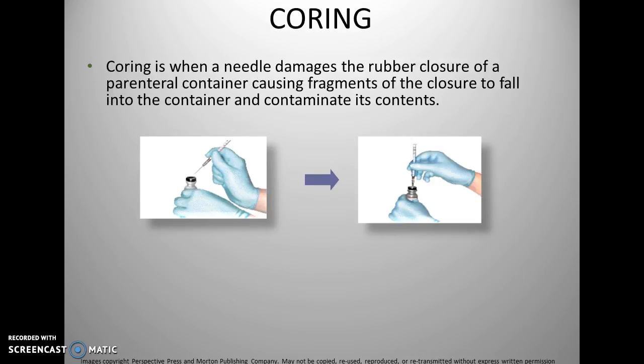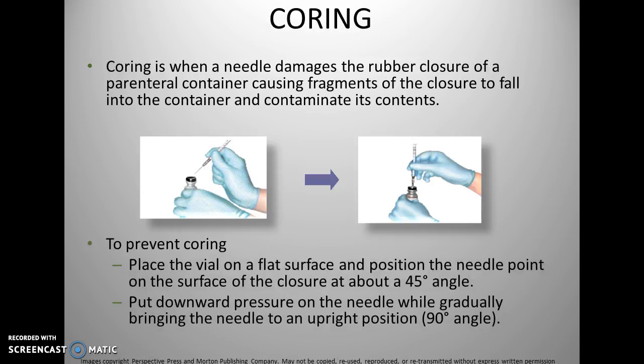So coring is when the needle damages the rubber closure of the parenteral container, causing fragments of the closure to fall into the container and contaminate its content. A big no. Okay. So how do you go about preventing coring?